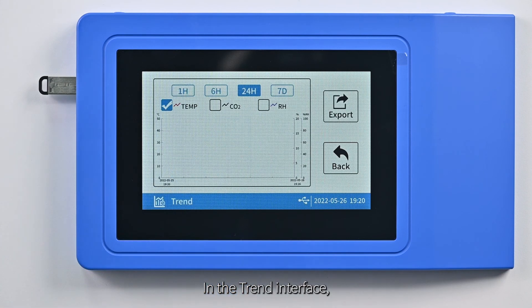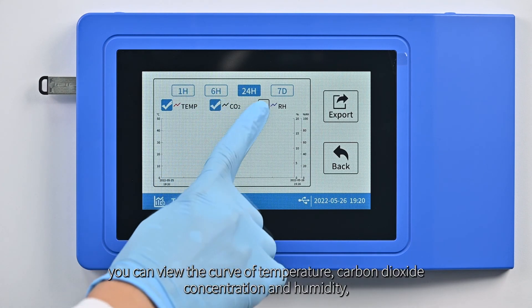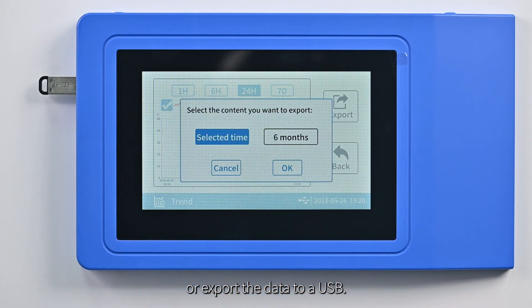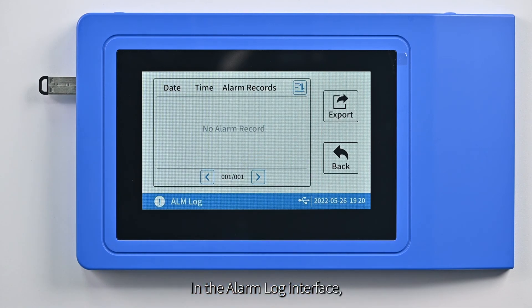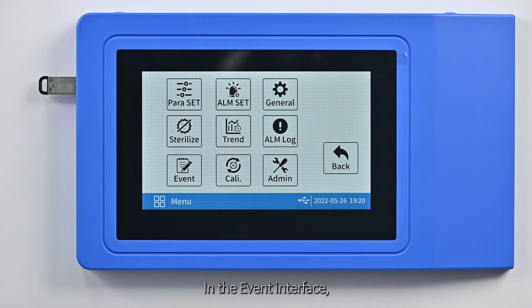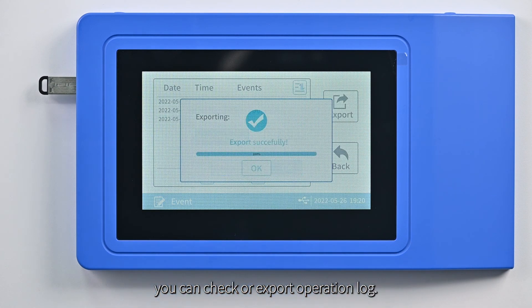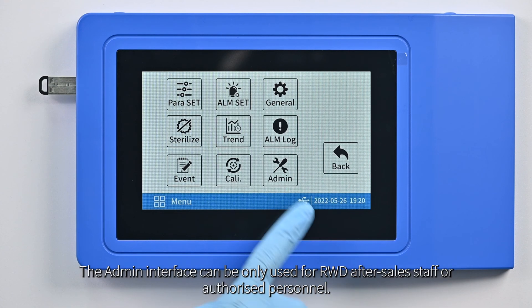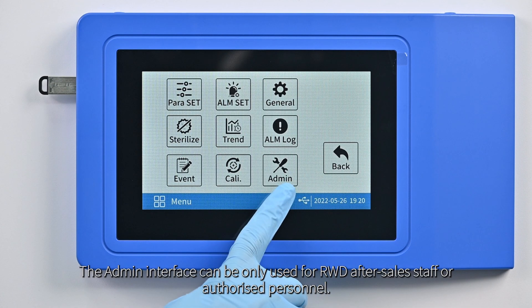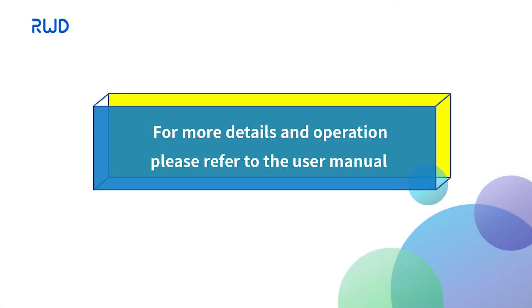In the trend interface, you can view the curve of temperature, carbon dioxide concentration and humidity, or export the data to a USB. In the alarm log interface, you can check or export alarm log. In the event interface, you can check or export operation log. The admin interface can only be used by authorized after-sales staff or authorized personnel. For more details and operation, please refer to the user manual.